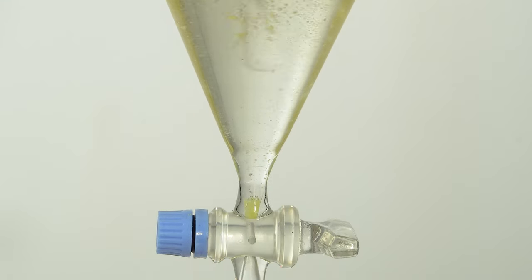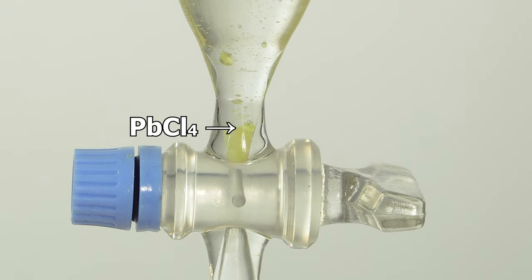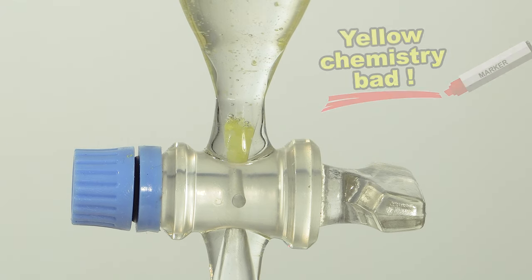Actually, lead tetrachloride is quite an unstable reagent, which is not surprising at all since it's yellow, and there are very few reactions involving it, but I'll show a couple anyway.